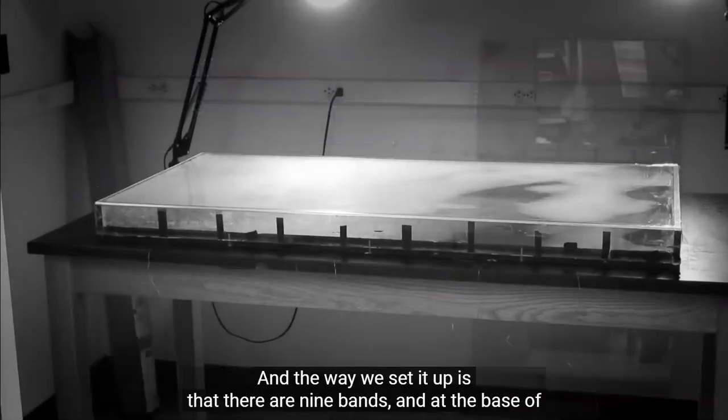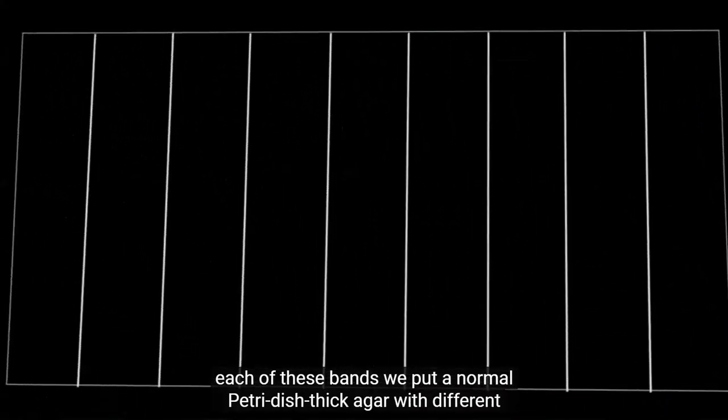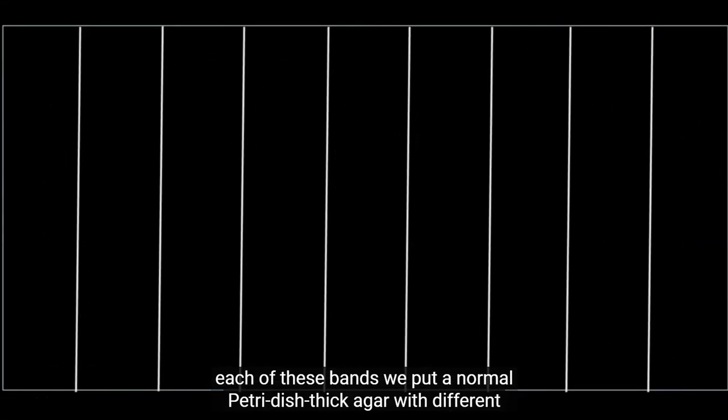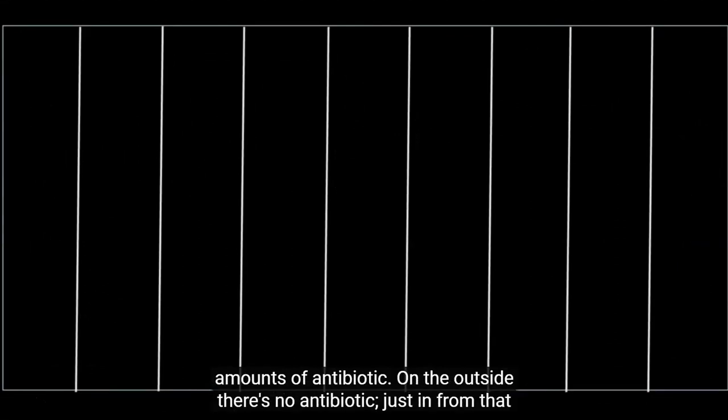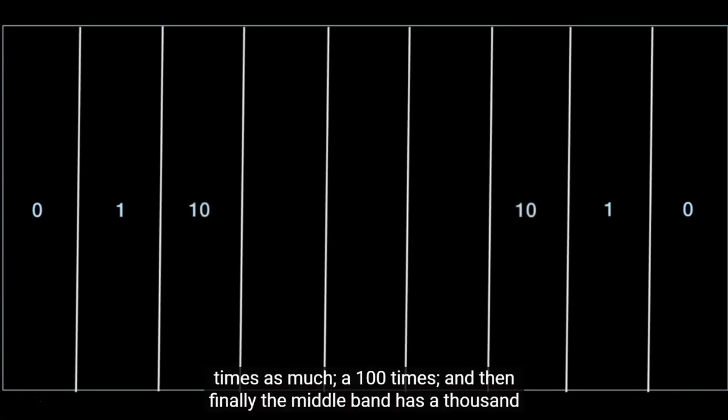And the way we set it up is that there are 9 bands, and at the base of each of these bands, we put a normal petri dish thick agar with different amounts of antibiotic. On the outside, there's no antibiotic. Just in from that, there's barely more than the E. coli can survive. Inside of that, there's 10 times as much, 100 times, and then finally the middle band has 1,000 times as much antibiotic.